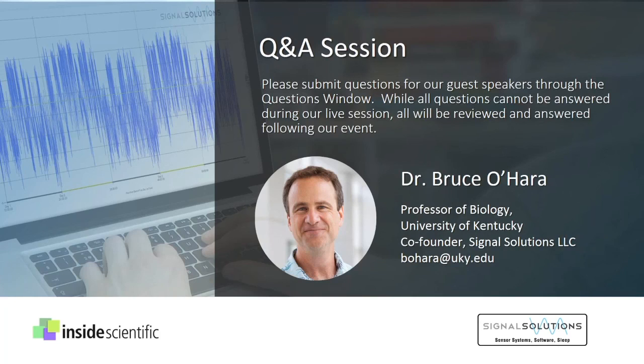And then we have our own under development that uses a novel mechanism of sleep disruption that's more variable, and we think it really keeps the mouse even more awake. That's down the road.